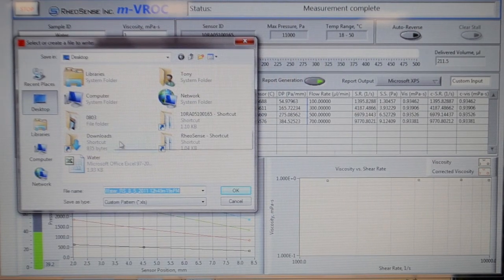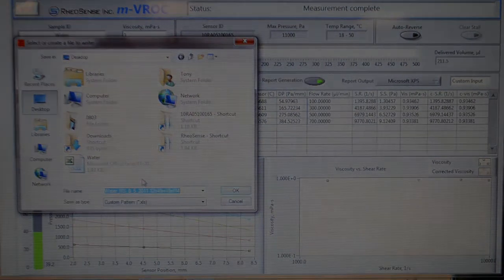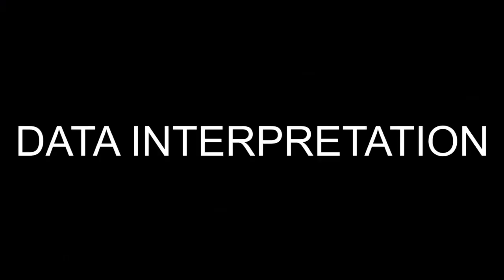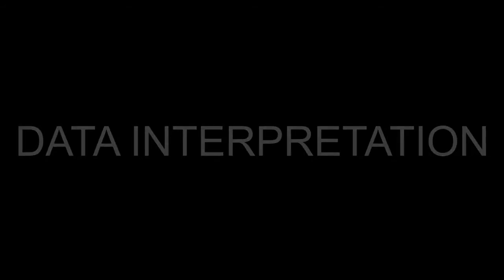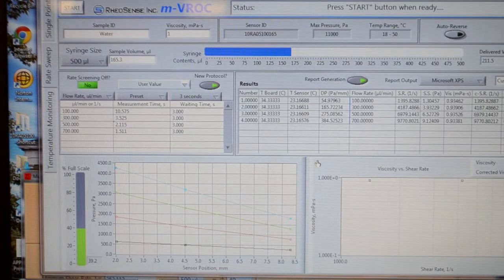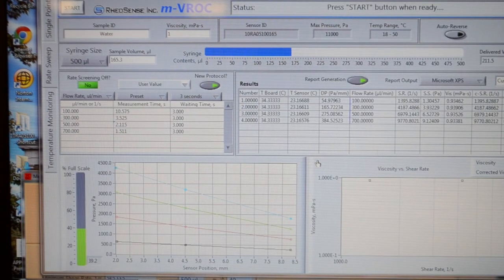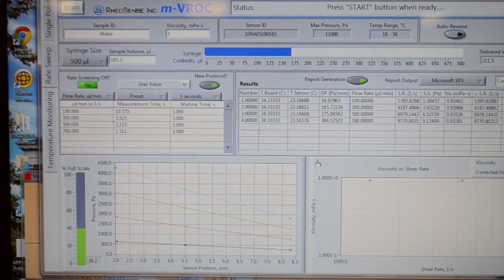Save the data. That was the end of our rate sweep measurement.